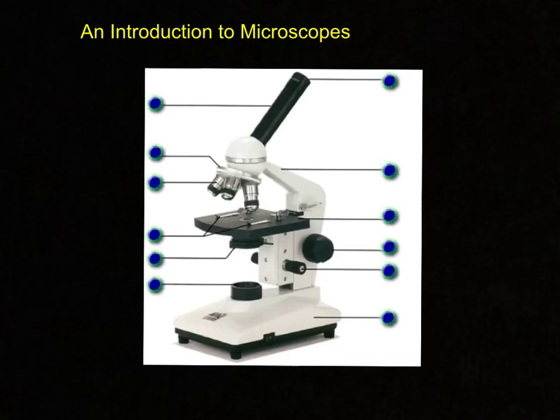In the end, we have two main components that we'll hold on to as we move a microscope. This is going to be true for any type of microscope. In this case, we have a picture of a compound microscope. So down here we have the base. The base is one of the strongest points of this microscope. We would put a hand underneath this, and our other hand goes on here, the arm. The arm is the part of the microscope that is going to be metal and hold a rigid frame. This allows for the microscope to be carried carefully from one location to the next, as we'll do from shelf to table and back from the table to the shelf.